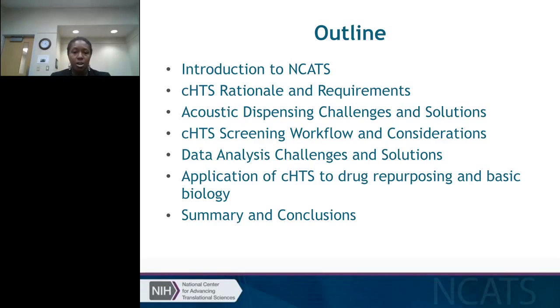Then I'll talk some about acoustic dispensing challenges and solutions. I'll also talk about our screening workflow and some considerations you'll need before starting, and also some of the challenges and solutions we have developed here for data analysis. And lastly, I'll give a couple of examples of scientific questions where you can apply drug combination screening to really understand drug basic biology, or to try and explore drug repurposing for various disease types. And then that will be the end of the talk.